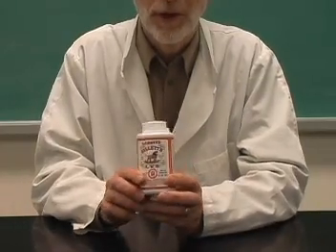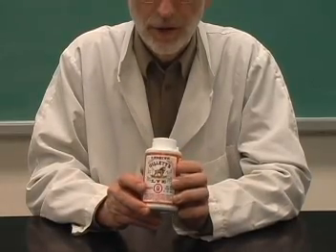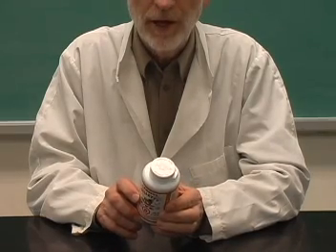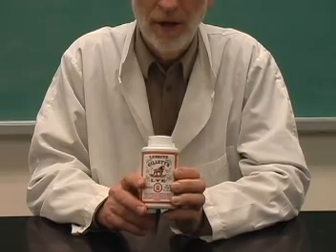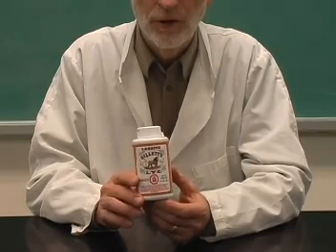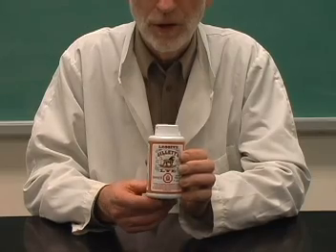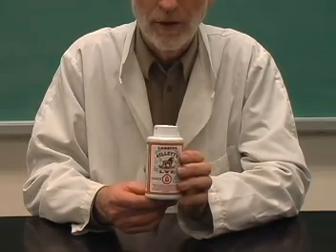Another source of sodium hydroxide is lye. This particular brand contains a minimum of 98.5% sodium hydroxide. It does not have the aluminum particles in with it. So this is actually a good size to use in the elementary school, and it avoids also having to separate the metal particles from the sodium hydroxide pellets.